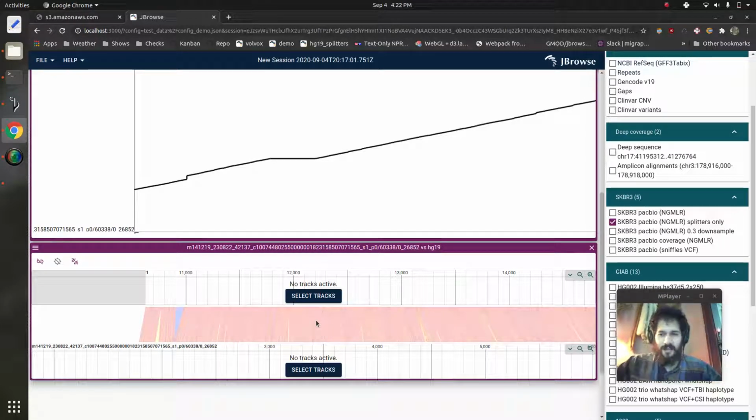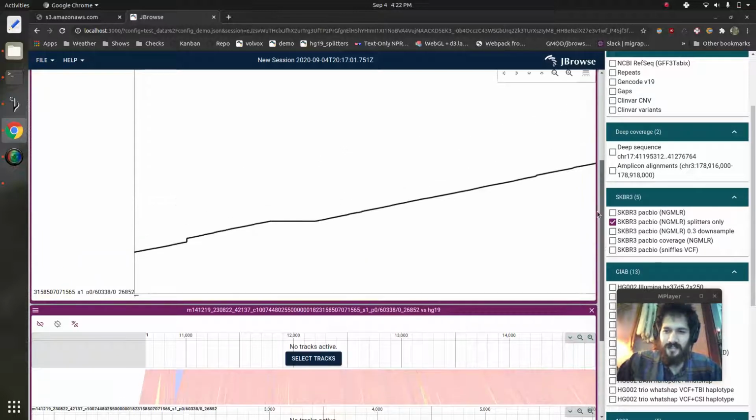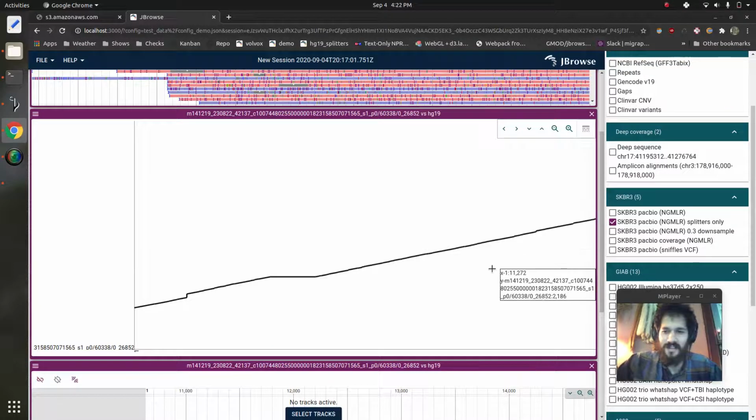So that's a little whirlwind tour of this new world of JBrowse 2, where we can dynamically create new views. This is all functional on your native BAM and CRAM alignments. It just uses the supplementary alignments tag, and we think it's really interesting for long reads, especially because it just stitches together any type of complicated structural variant view.